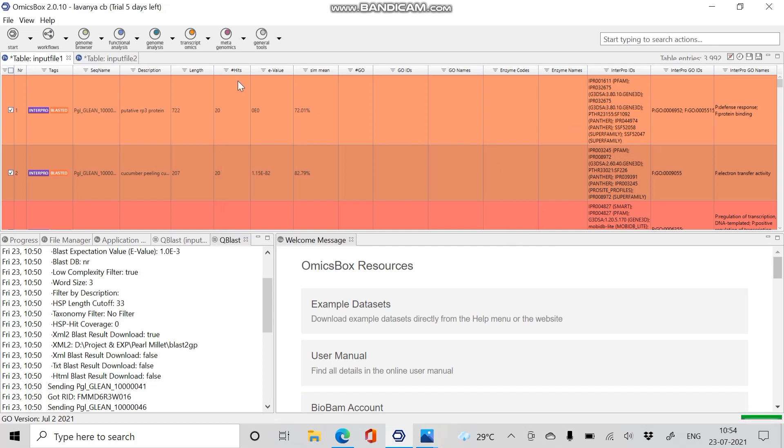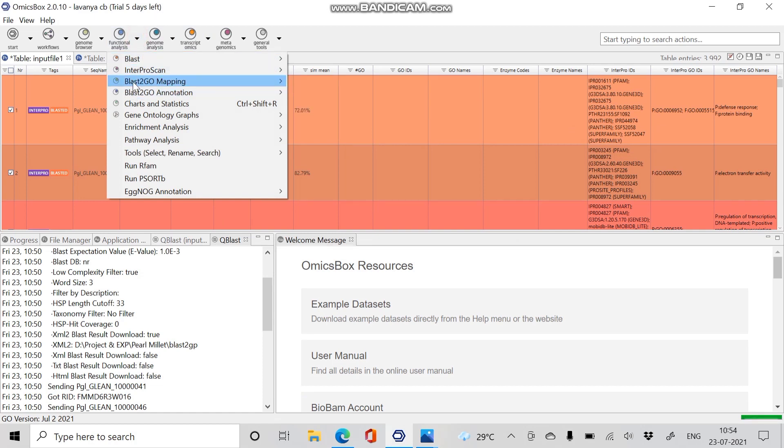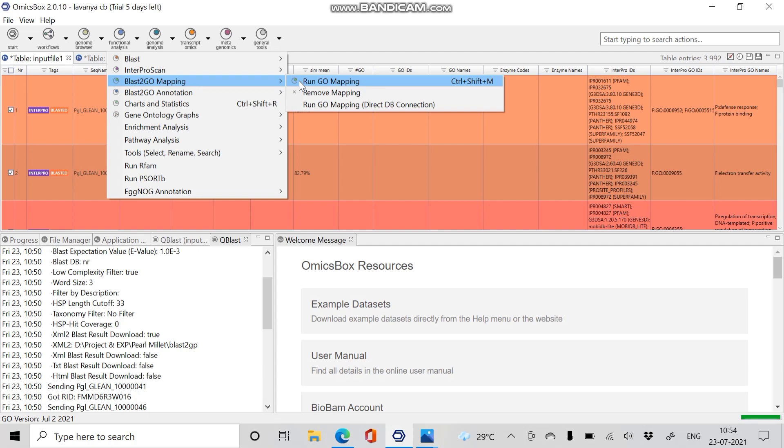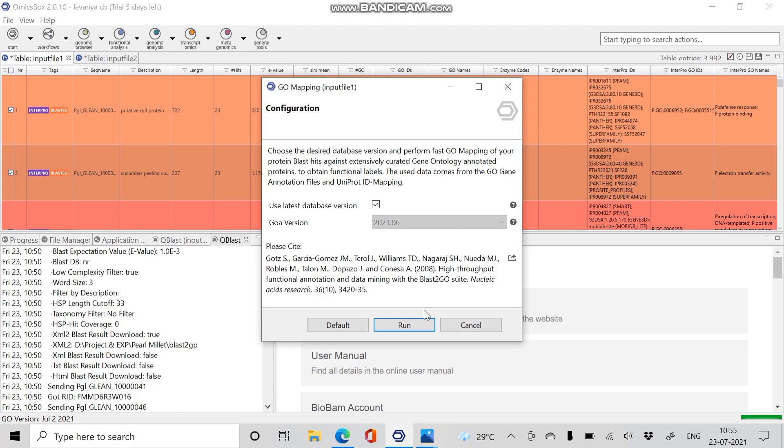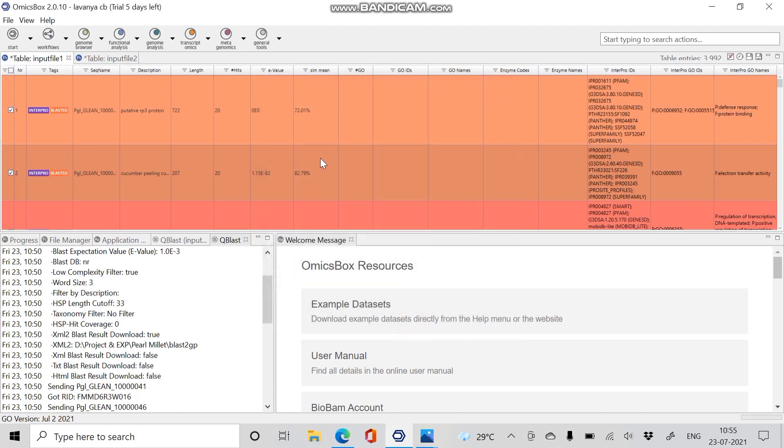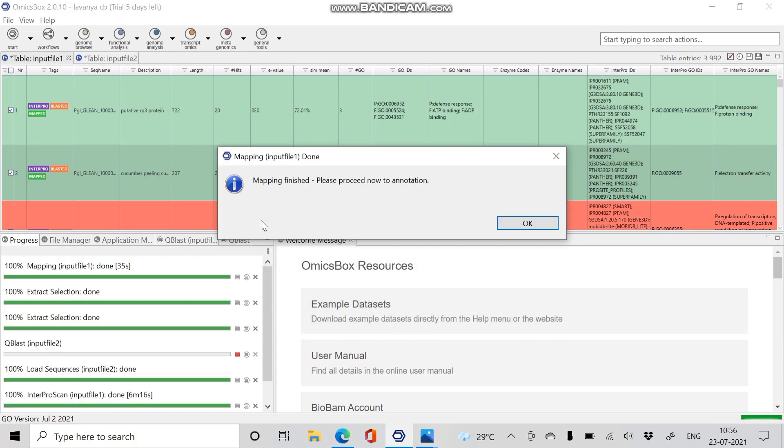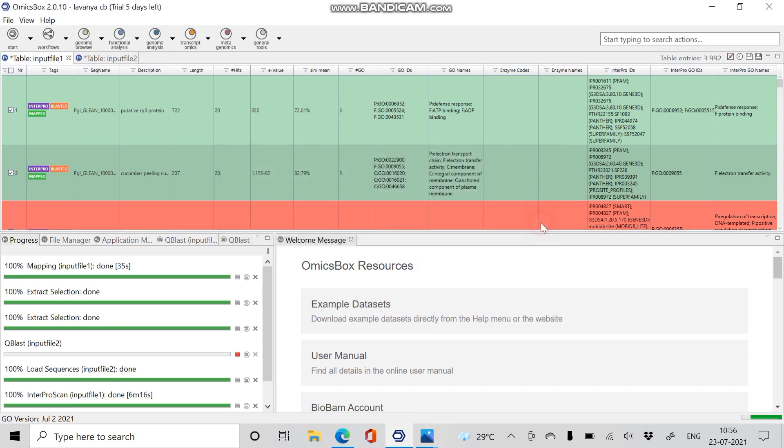The next step is mapping. Click on Functional Analysis, click Blast2Go mapping, and run GO mapping. Mapping is a process of retrieving GO terms associated with the hits obtained by the BLAST search. Here, based on the BLAST result accessions, it retrieves the gene names or IDs from the database. Click Run. The mapped sequences will turn green. Once after mapping is finished, now proceed with annotation.